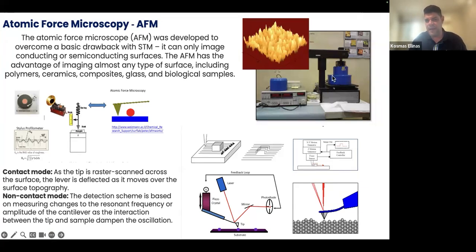The modern AFM microscopes can work in contact mode, so you have a mechanical interaction between the surface and the tip, and of course in non-contact mode, in which, when the tip is very small and very sensitive and you go really close to the topography, you can see vibration, and the frequency of the vibration is translated to an image.